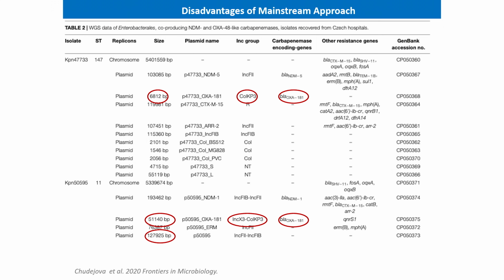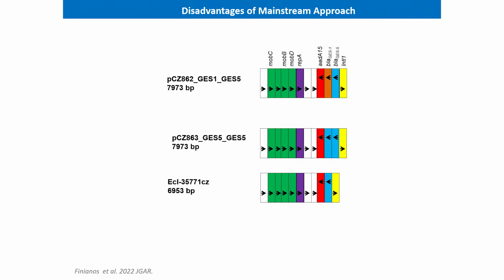And of course, Klebsiella normally have 7, 8 or 9 plasmids within the same isolate, and these plasmids are really kind of big, so 100 kb and above. So it really takes a lot of time when you're dealing with short-read sequencing to actually close these plasmids. I'm giving so many examples just to say that you could say, for example, I would face this problem once in three months. That's not the situation. You could face this every week.